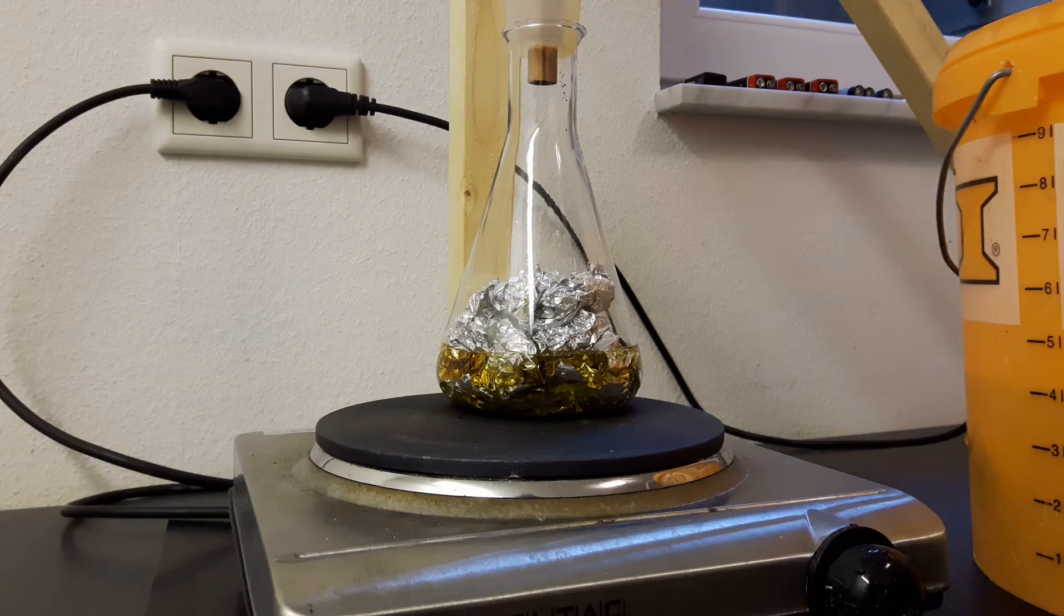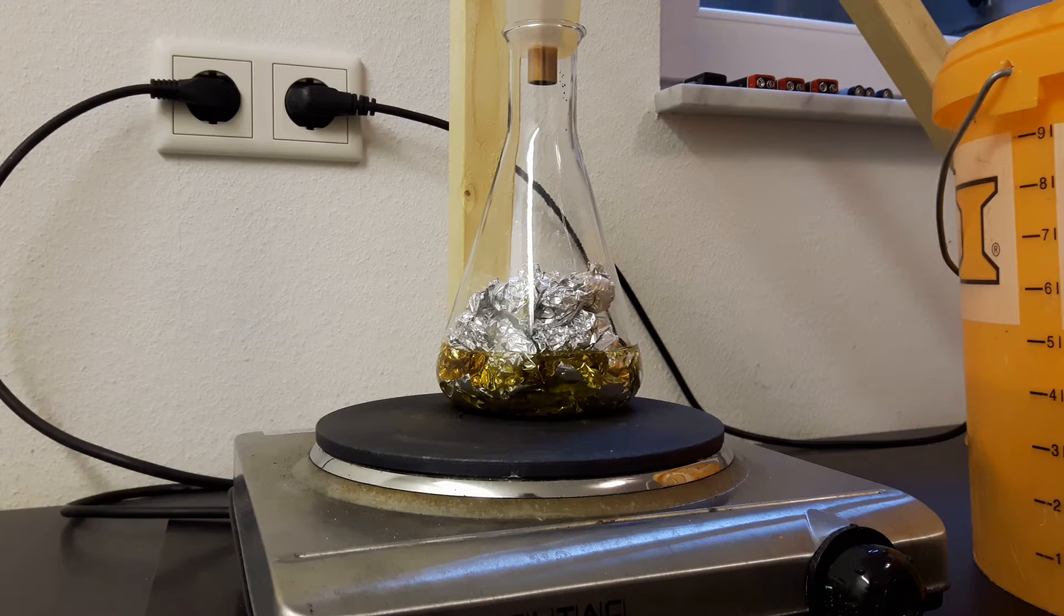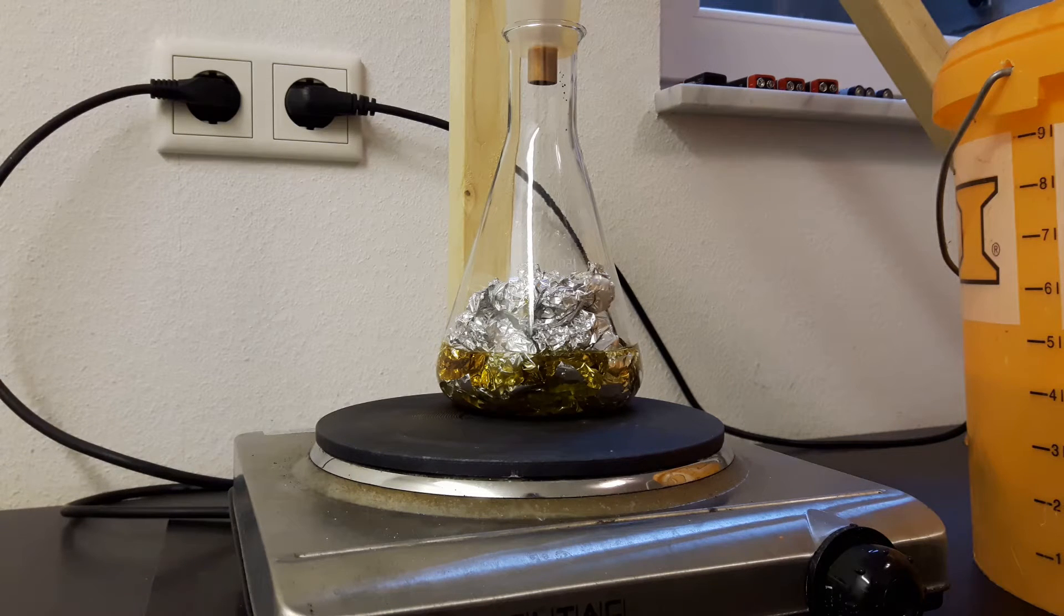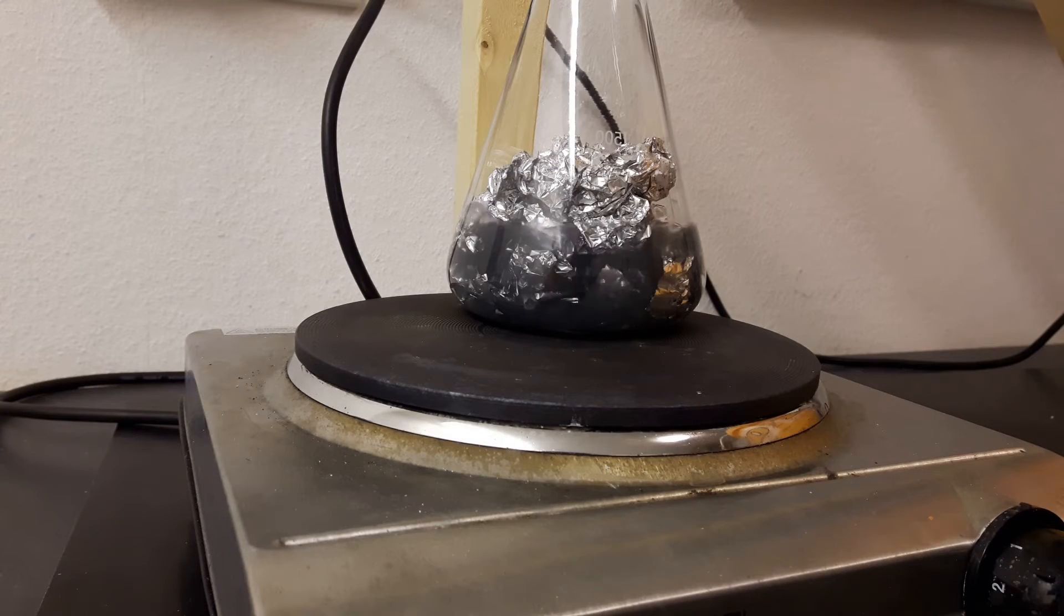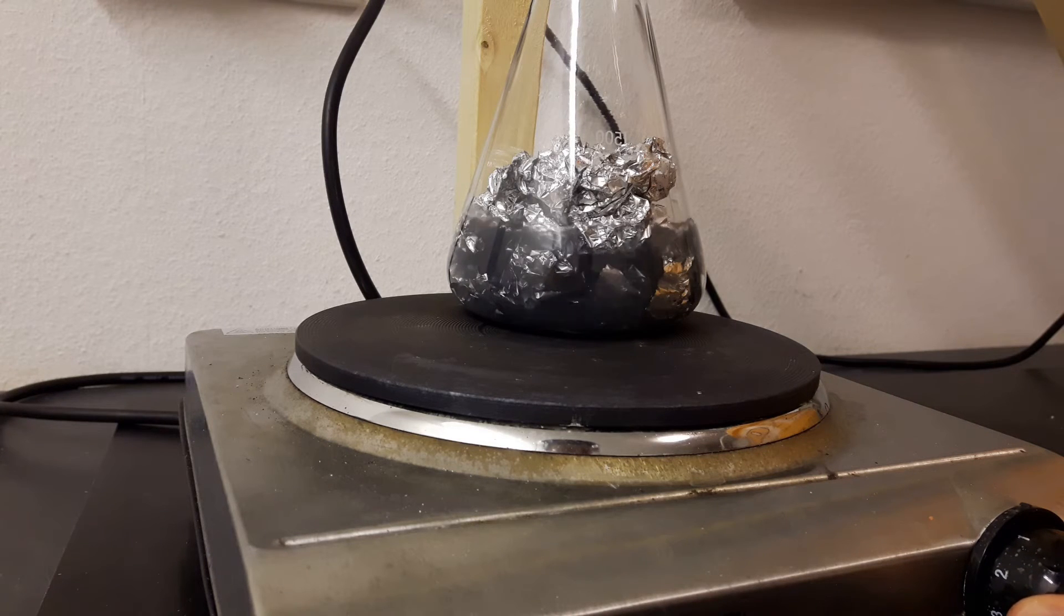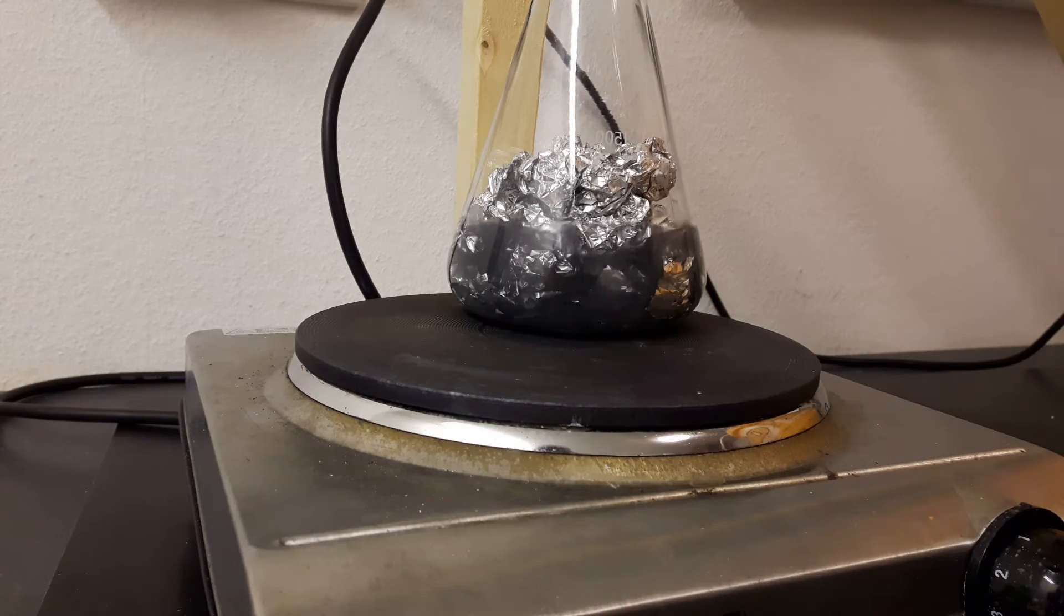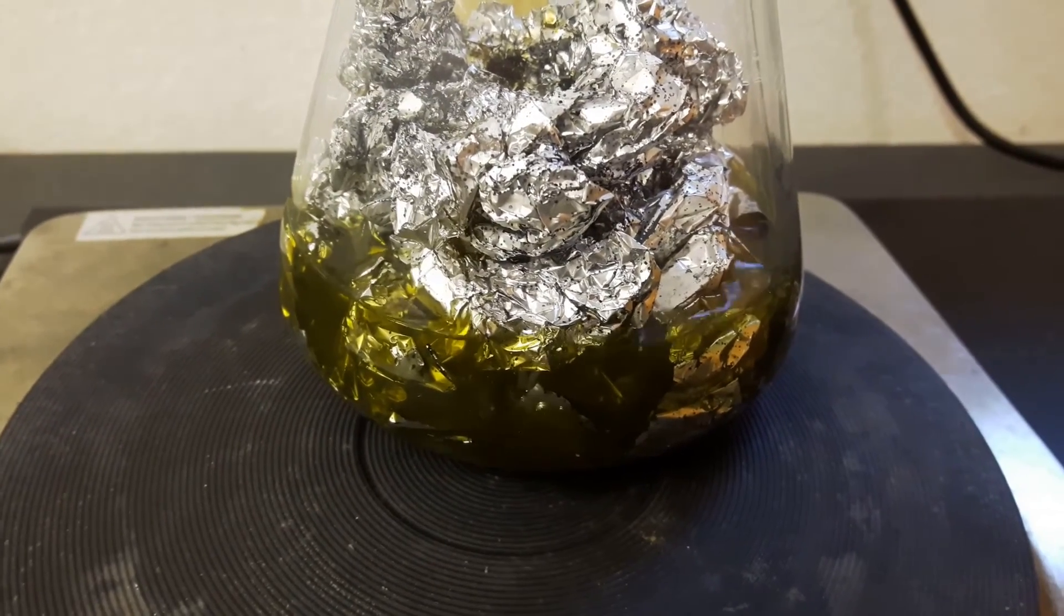So here you can actually see the Erlenmeyer flask that is placed on the hot plate. And the isopropanol was a bit orange due to iodine dissolved. But after a bit of boiling under reflux as you can see here it entirely vanished.